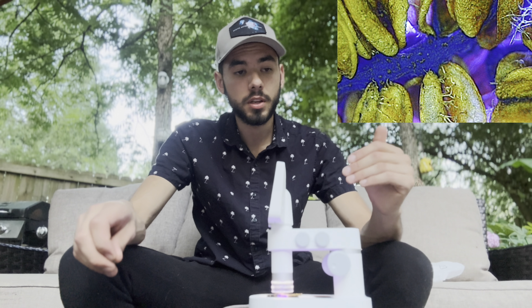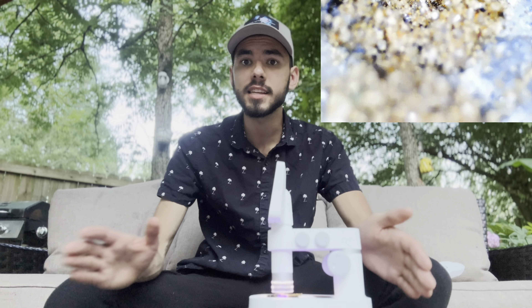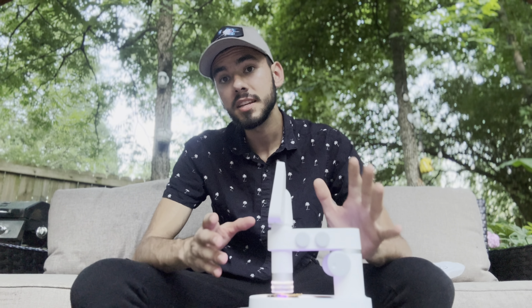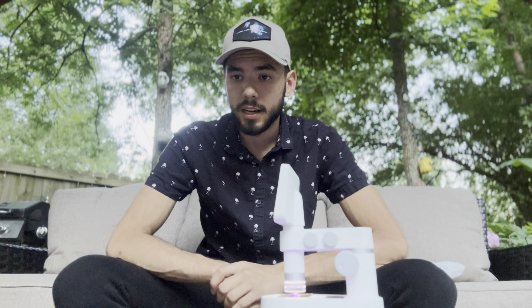You can use it to study rock formations and flowers. Studying rock formations allows you to see different minerals — things you would also find in asteroids and meteors, things you'd find out in space. You can actually use this microscope to study the kinds of rocks and minerals that would be on other planets or on asteroids. Remember how NASA sent a space device to collect surface material from an asteroid? Some of the different minerals you see by observing rock formations are going to be some of the same kinds of materials you could potentially find out in space.